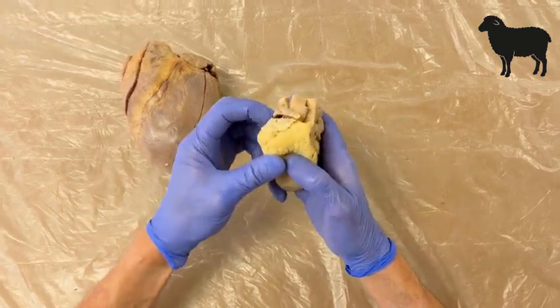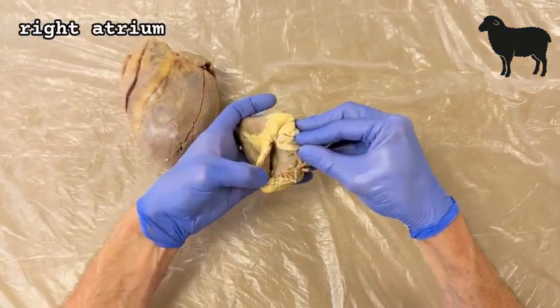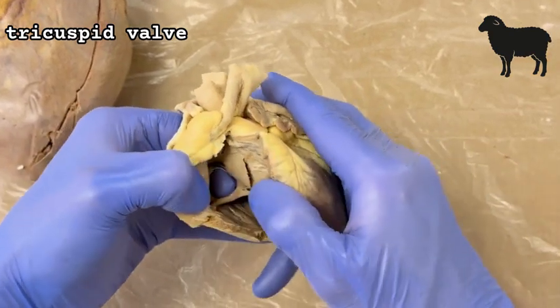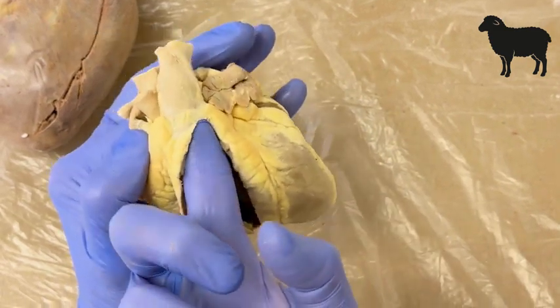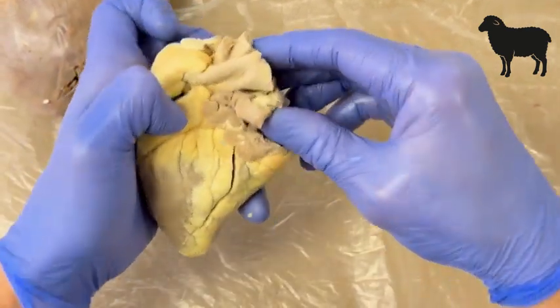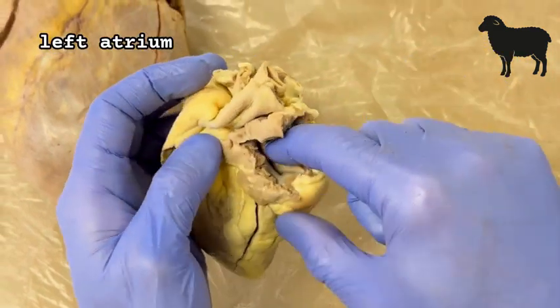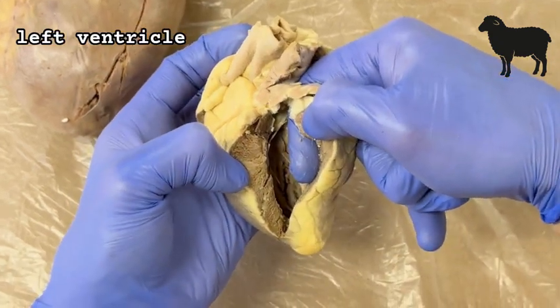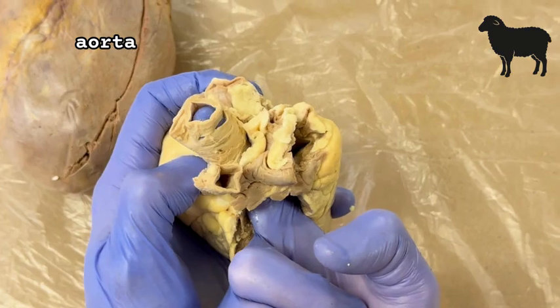The right side of the sheep heart is shown here with the right atrium. Blood passes through the tricuspid valve into the right ventricle and then out the pulmonary artery. Blood returns from the lungs to the left side, to the left atrium, across the mitral valve into the left ventricle, and then out the aorta to the body.